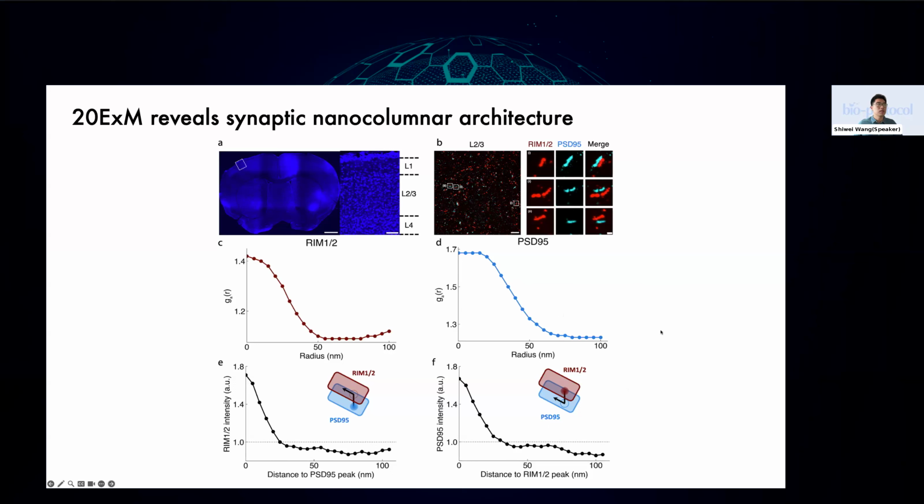And from the neuroscience perspective, this is very significant because this suggests that these clusters in the biological sample are closely controlled to align with each other with high precision so that the distance a neurotransmitter has to travel is minimized. And that's important for the synapse efficiency. And all of these are consistent with the previous reports of these structures.